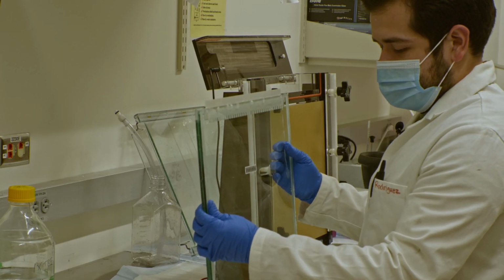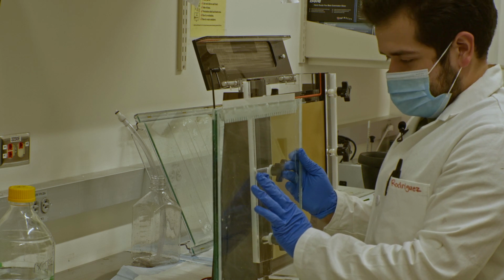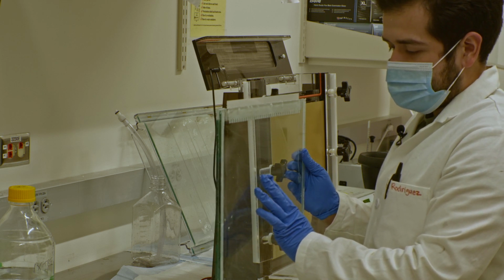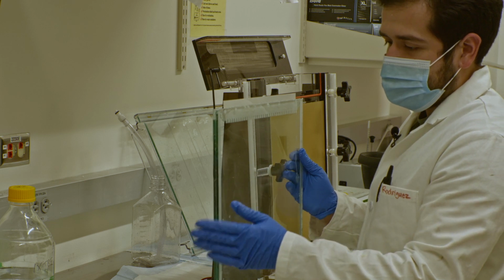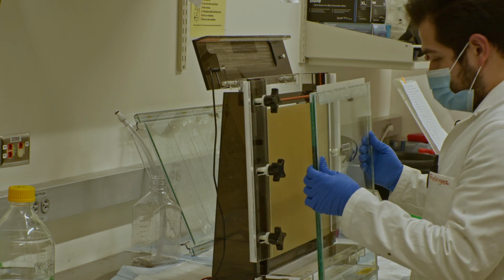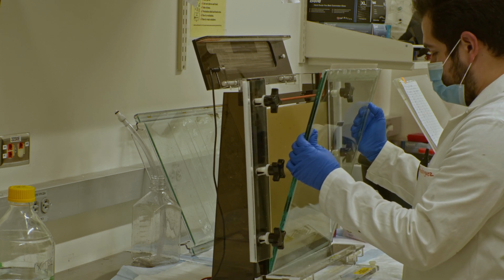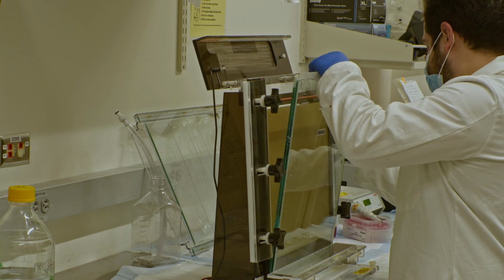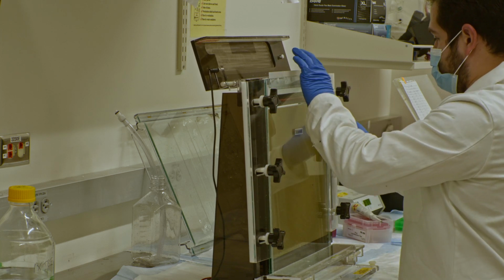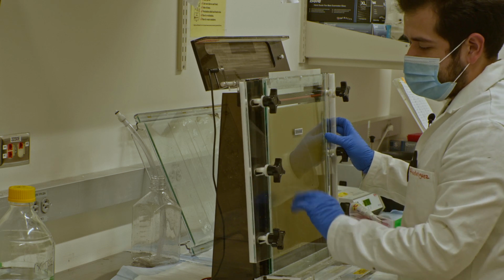And you know you have the right side of the gel whenever you see this indicator. This indicator is here just to make sure that you know how hot your gel pieces are, which is quite important. There is such a thing as overheating the gel box. If you do, you could potentially crack your glass. If for any reason there is some sort of buildup on the back glass plate, make sure you clean it off really well.